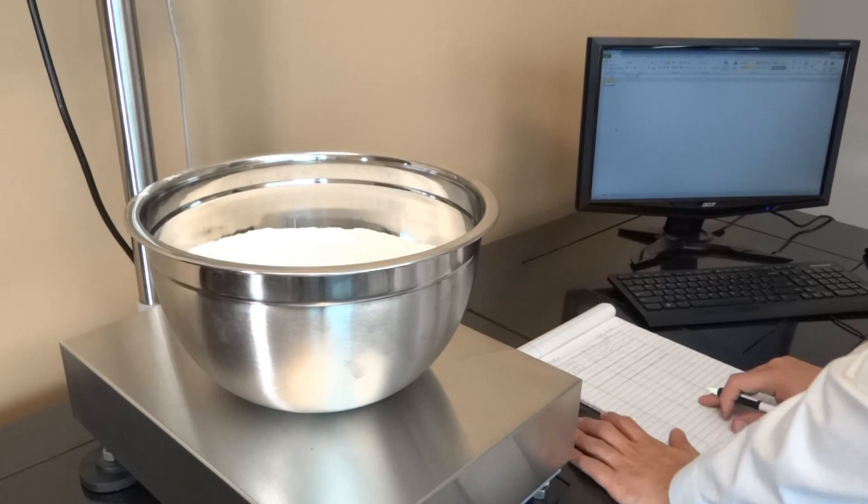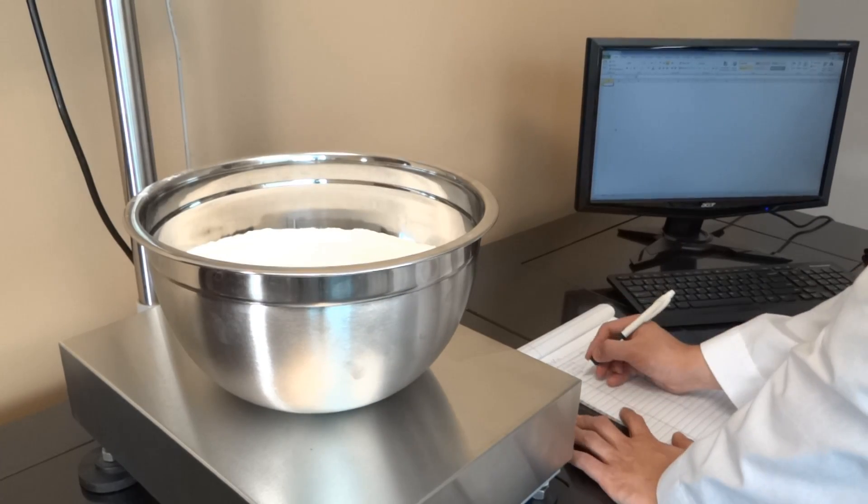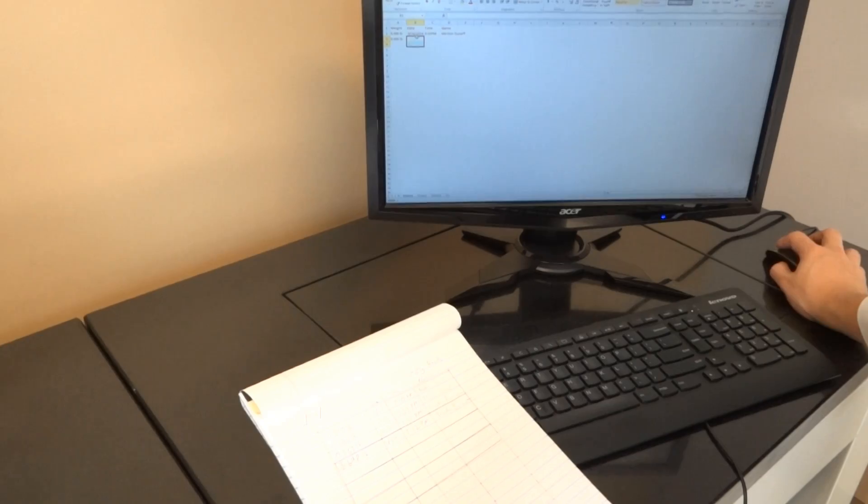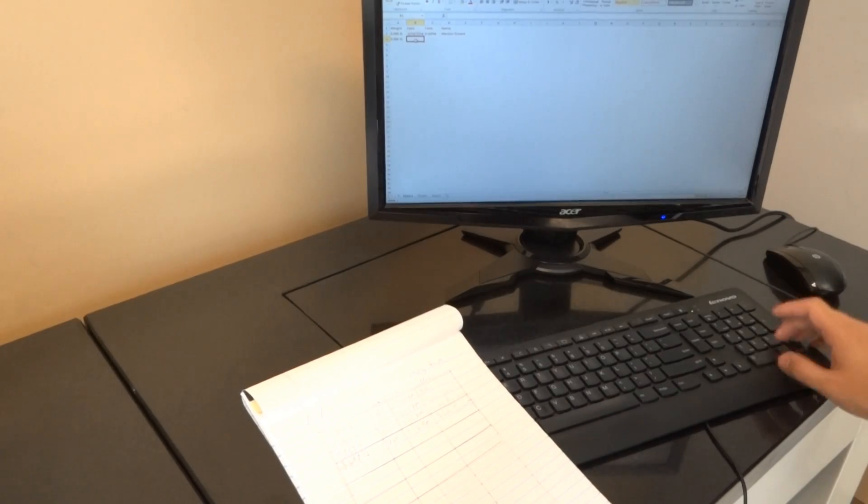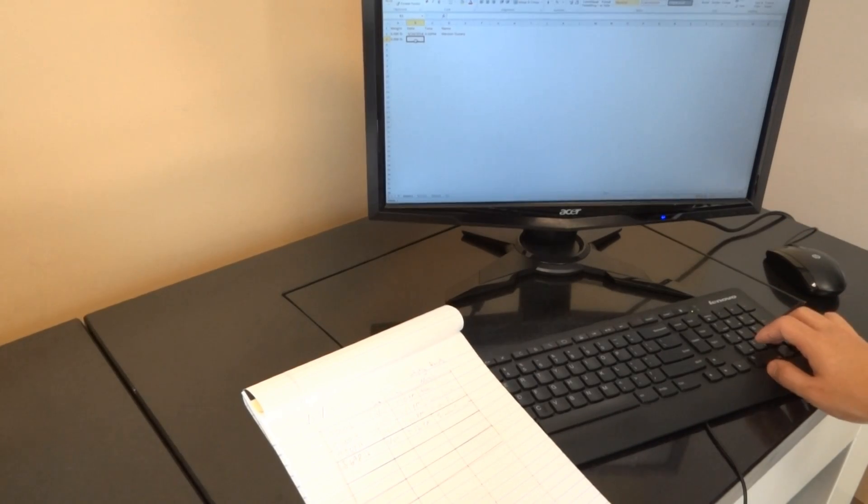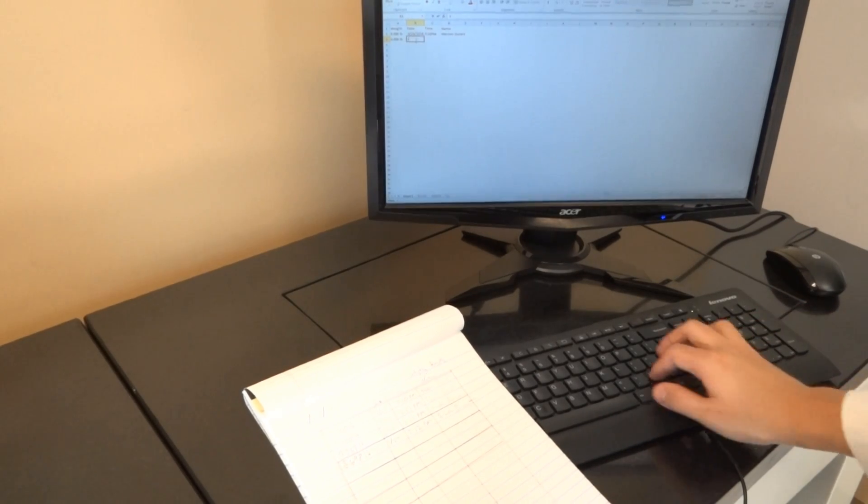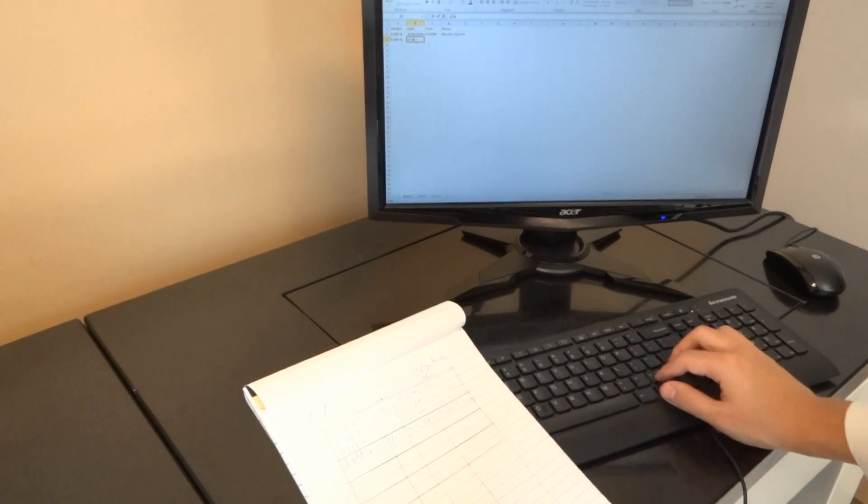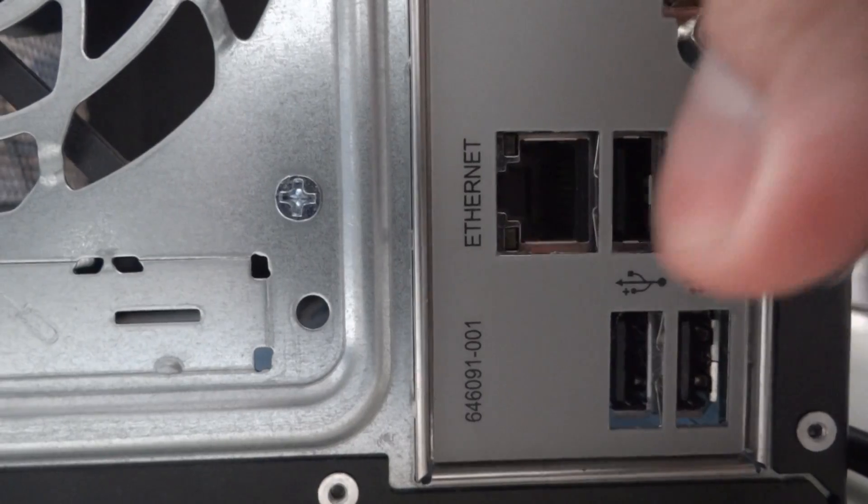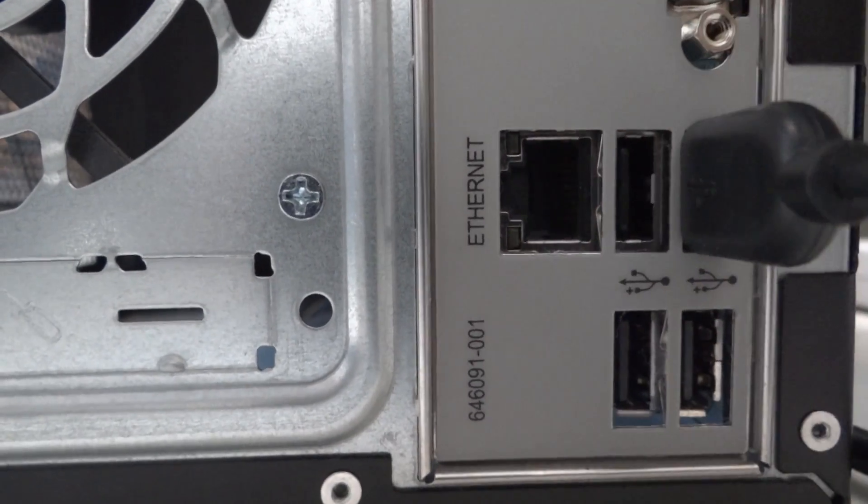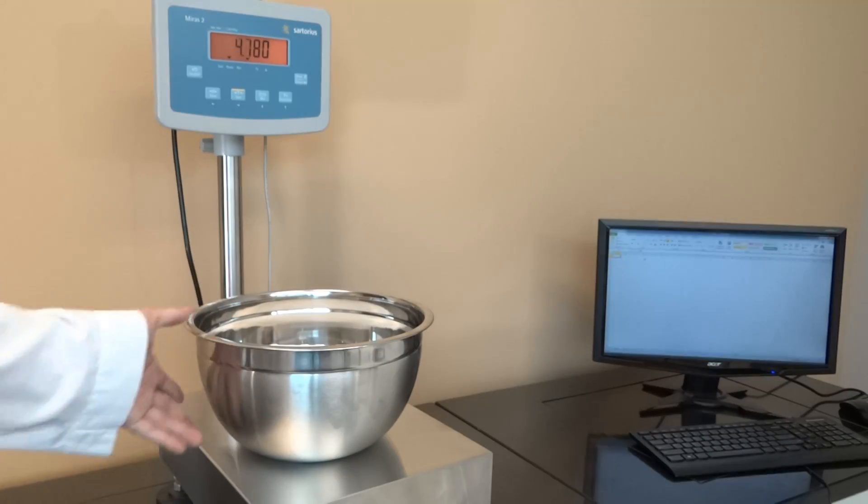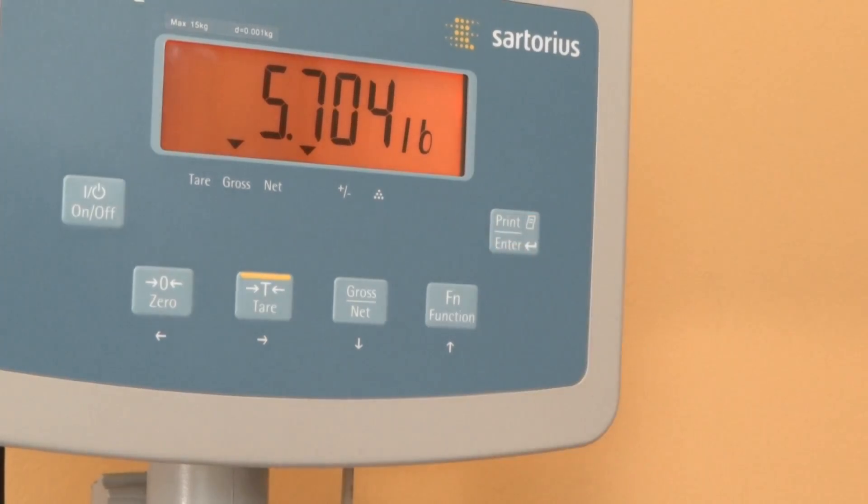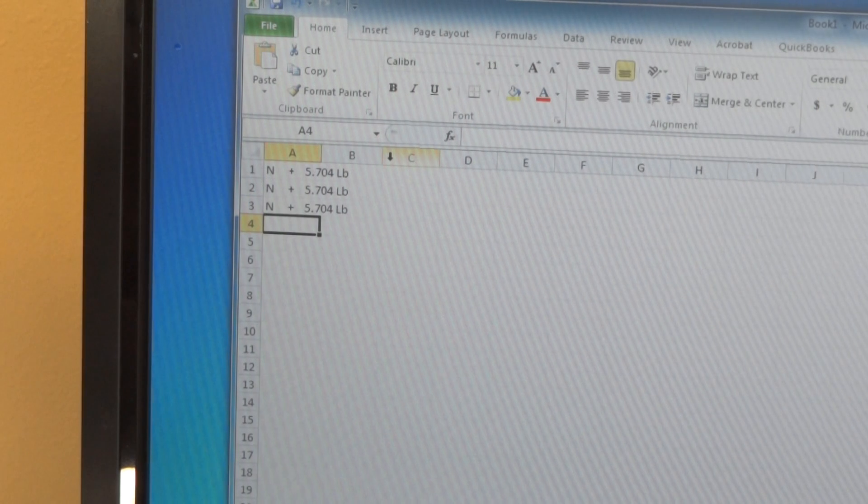Weighing data is often recorded by hand after every measurement, and later the handwritten data would be added manually to a spreadsheet. But this extra step can be circumvented by utilizing RS-232 or USB connectivity solutions.